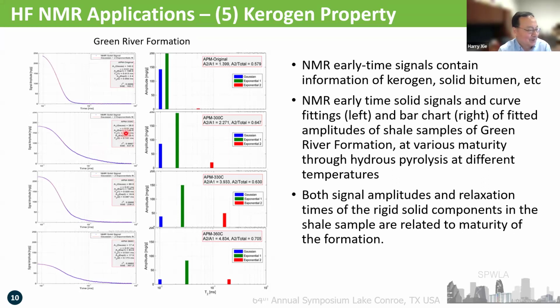When we do this measurement, it takes a few minutes and you get it done. But for pyrolysis, you need to prepare a sample and then put it in the machine, and it takes hours to get the results. So sometimes we can get a quick measurement using NMR to try to understand the properties of a kerogen, put it that way.